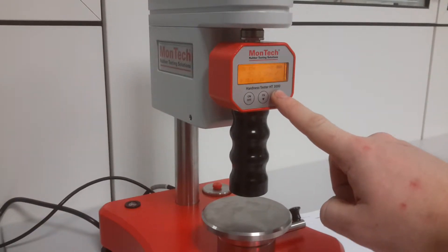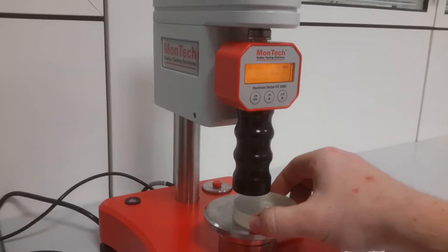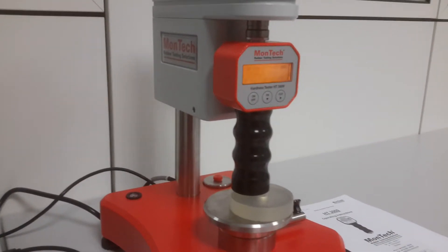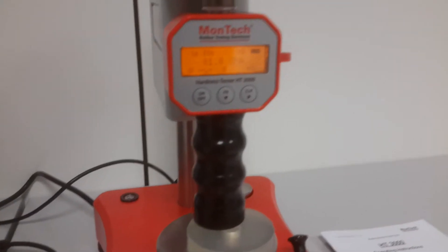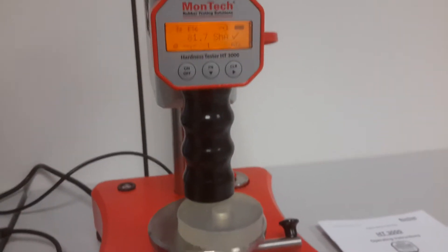Let's clear the old results, place a sample and hit the start button. After the set indentation time, the results are read automatically.